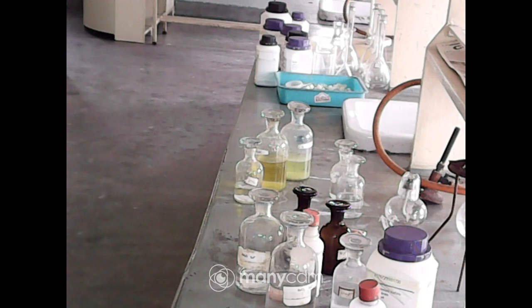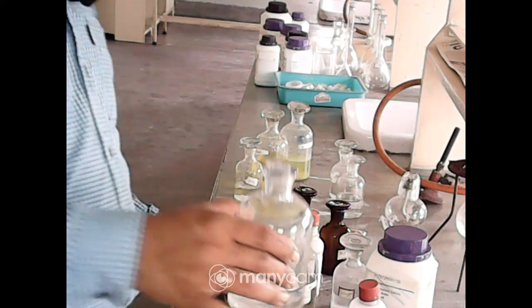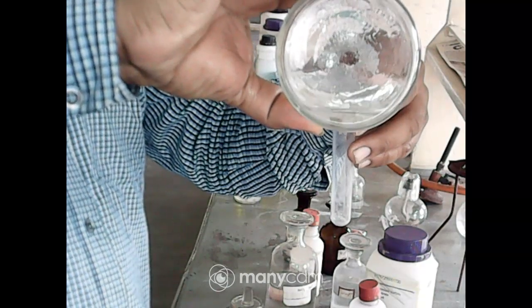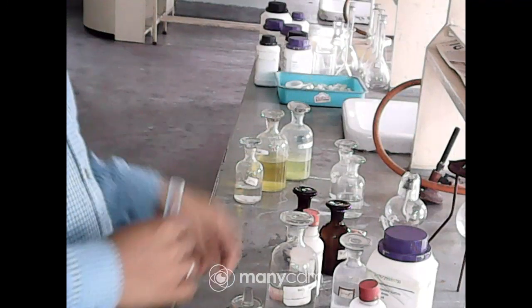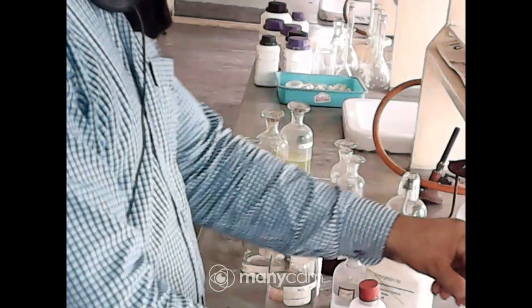Next I am going for ammonium chloride as an unknown sample. So ammonium chloride is already in liquid form. I am taking it from here. Now this just works as the OS. Okay, this just works as the OS. Now kept it reserved. In another test tube, I will take a little amount of ammonium chloride.